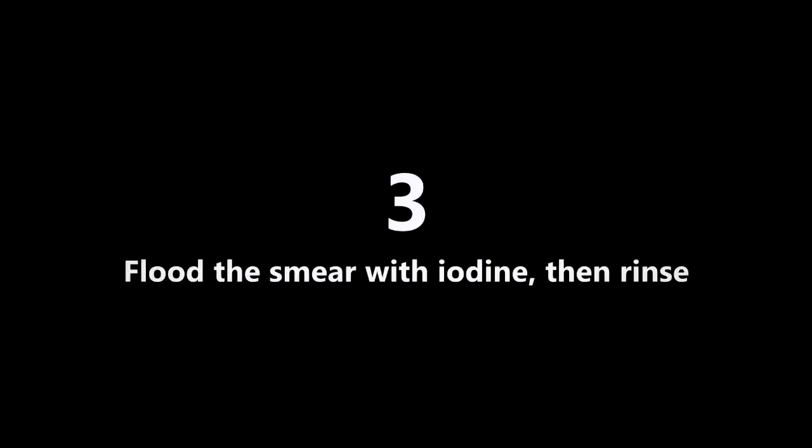Step two, part three — flood the smear with iodine, then rinse. Use a pipette to cover the smear with iodine and let it sit for at least 60 seconds, then rinse off with the same careful technique.